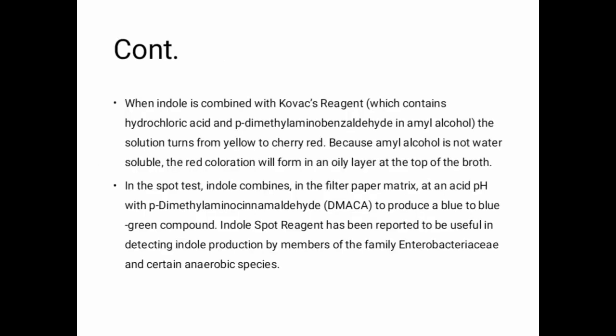The first method is when indole is combined with Kovac's reagent, which contains hydrochloric acid and p-dimethylaminobenzaldehyde in amyl alcohol. The solution turns from yellow to cherry red.